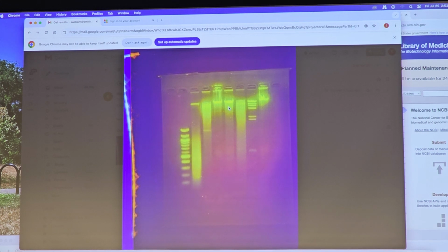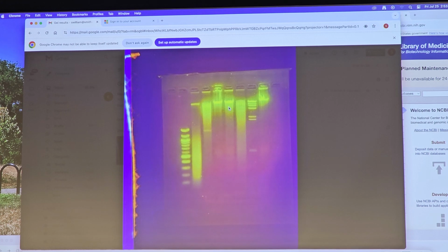And now what we find is that in adult tissue, there's a lot of methylation because all those genes that aren't needed in that tissue type are heavily methylated and shut down. There are other repetitive regions of the genome that are methylated and don't get transcribed. So this kind of experiment was really the first to demonstrate heavy methylation of genomes.